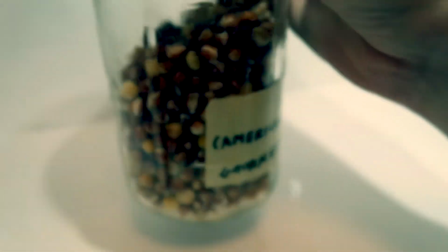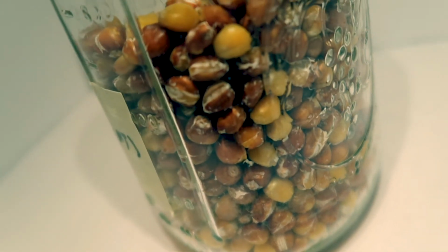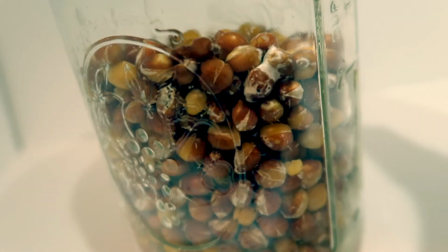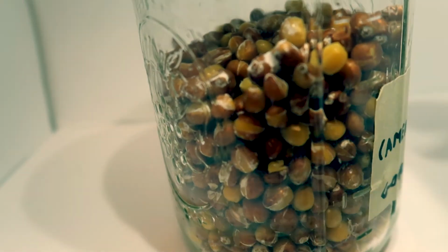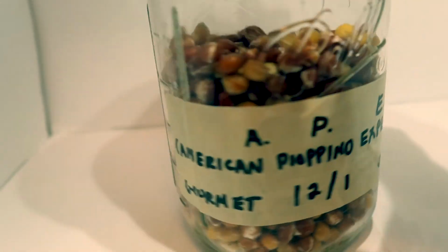And now we can see all the grains are nicely separated, and I am easily able to shake and mix these all throughout the jar, just like this. And you can really see the difference in the coloring of the grains. The mycelium turned the other ones kind of a darker brown, while that section of uncolonized grains with this grain-to-grain transfer was still that traditional popcorn yellow. So that just kind of worked itself out as a point of reference to make sure you've really mixed up all of these grains. And the same thing here, probably less than a week, this will be fully colonized and ready to spawn to a bulk substrate.